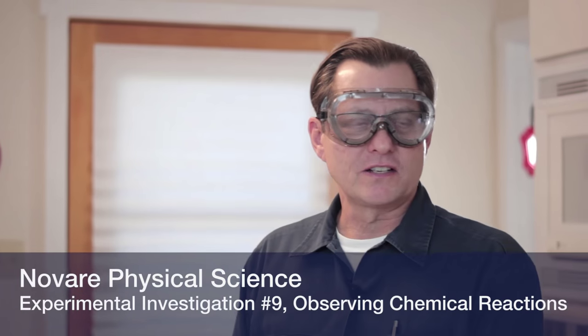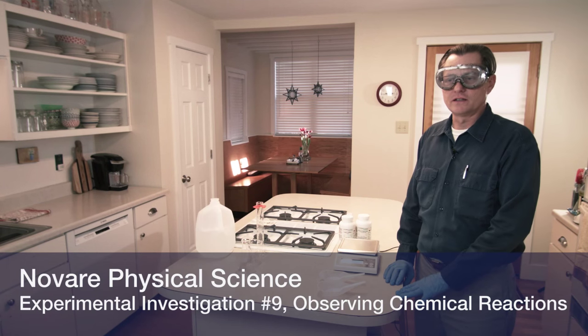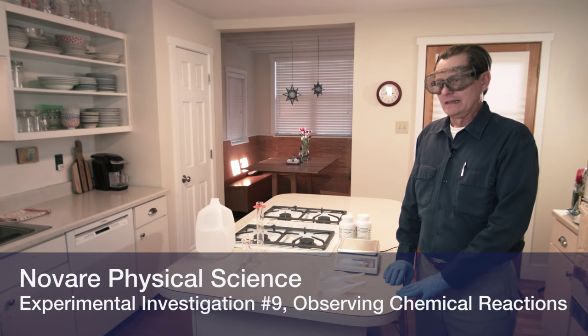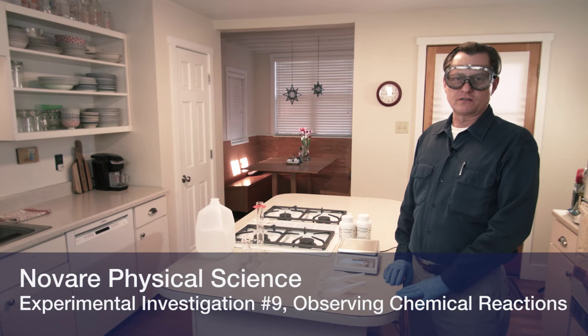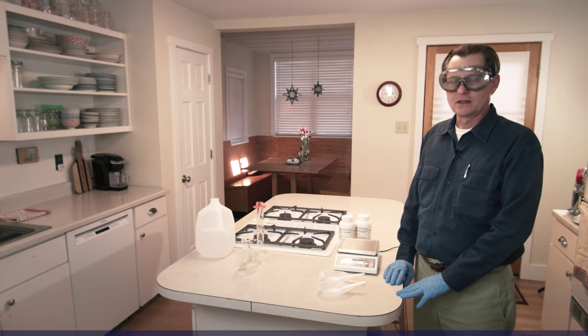This is experimental investigation number nine for Novare Physical Science. In this experiment, we're going to go through a sequence of six chemical reactions, and students are going to observe and document their observations at each step.